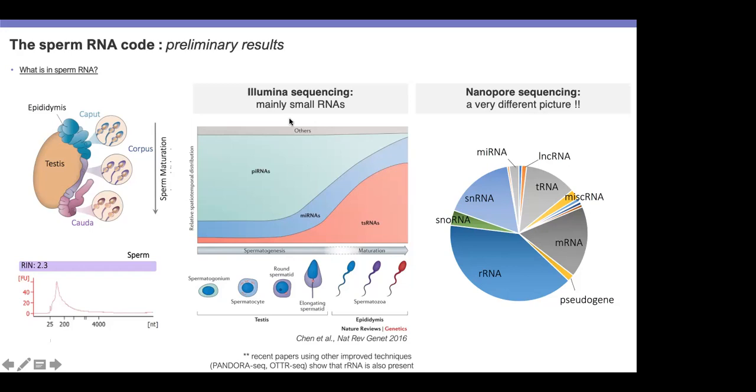But sorry, you don't change the membrane that contains the nanopores after every experiment, right? That changes every experiment. So the flow cell has the membrane with the pores, and you put a new one each time, right? So as you sequence, the pores are biological pores in reality, right?